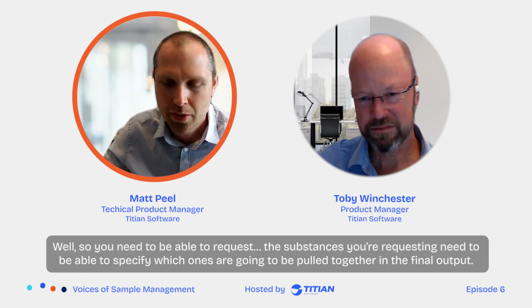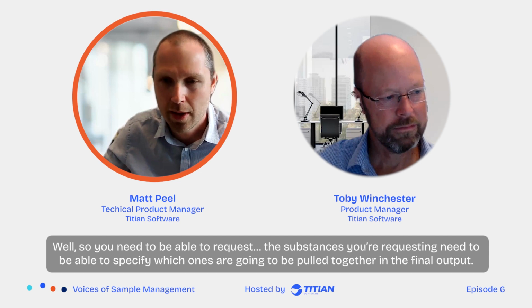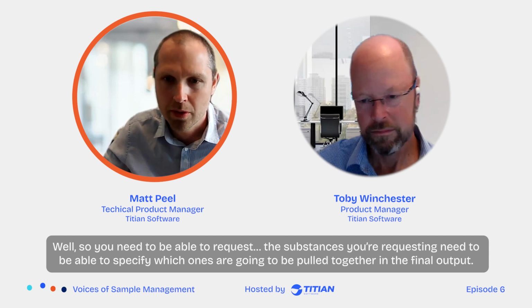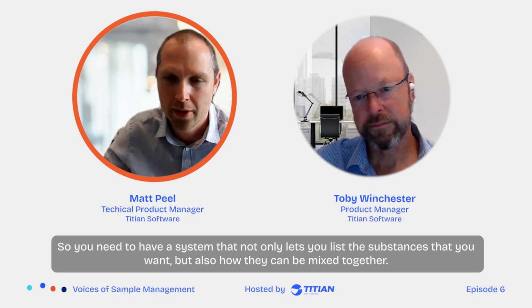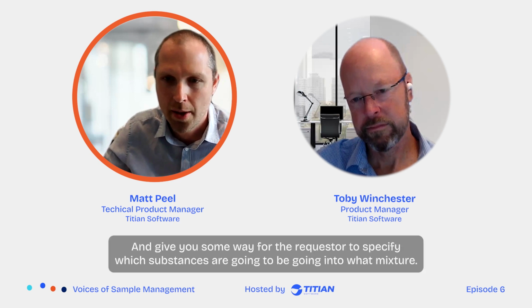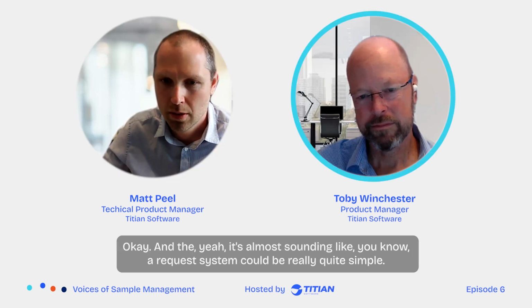Well, so you need to be able to request the substances you're requesting. You need to be able to specify which ones are going to be pulled together in the final output. So you need a system that not only lets you list the substances that you want, but also how they're going to be mixed together, and gives the requester some way to specify which substances are going into what mixture.